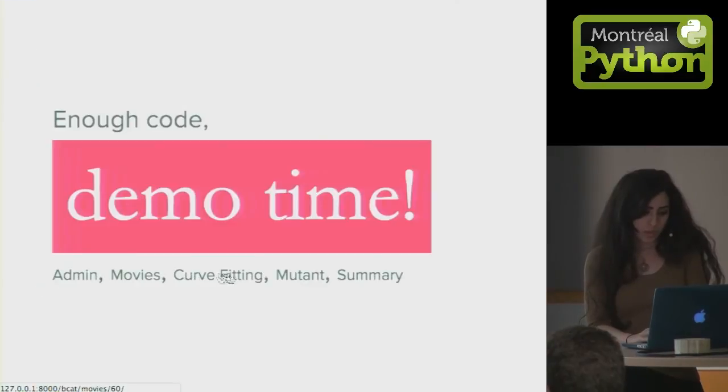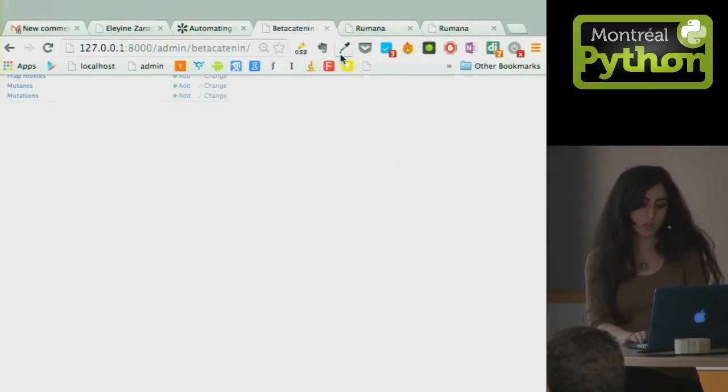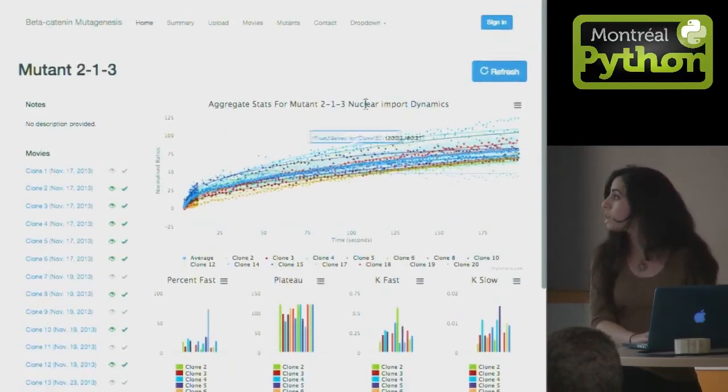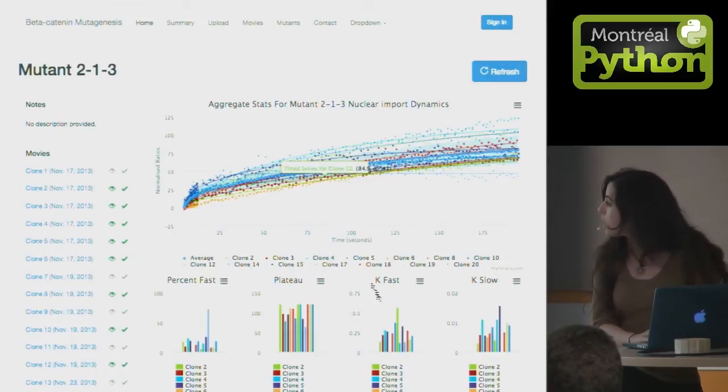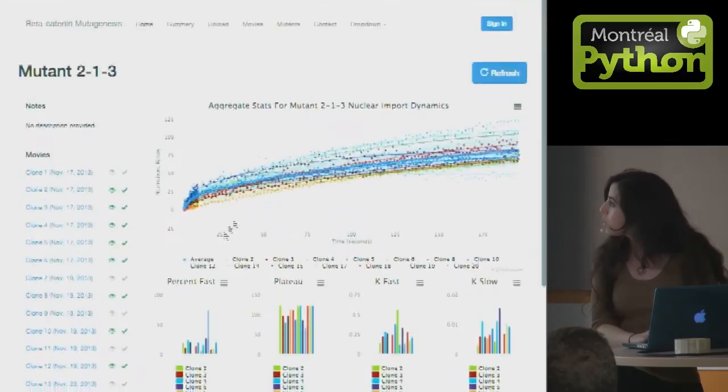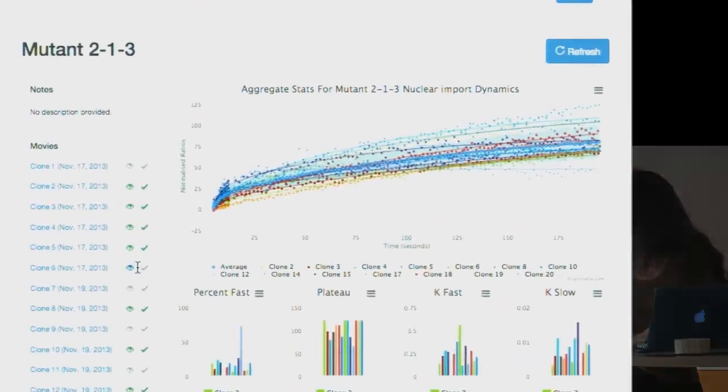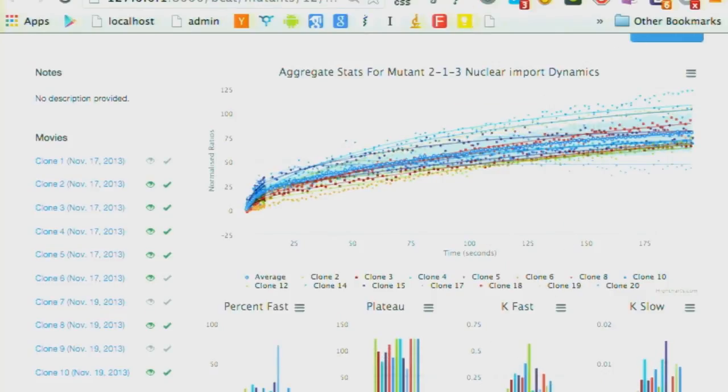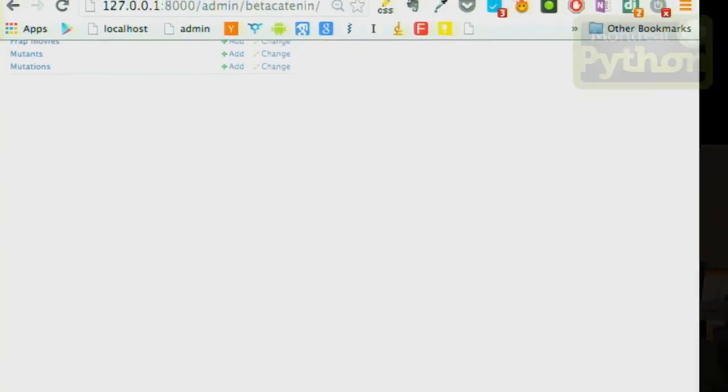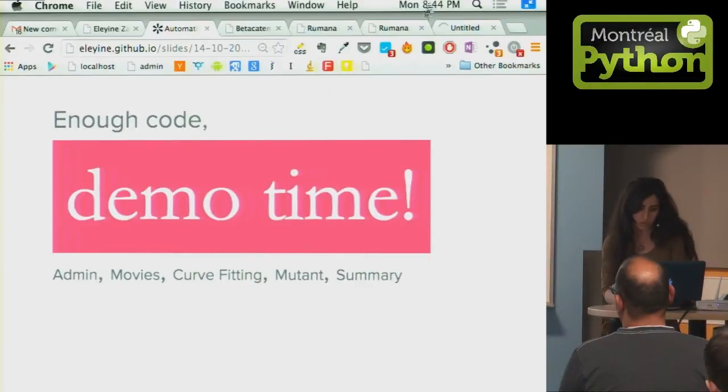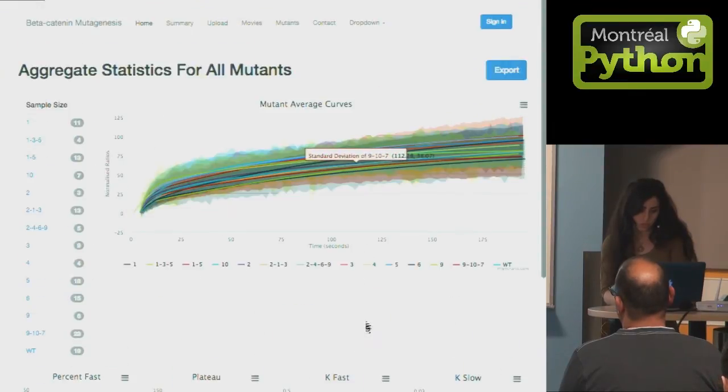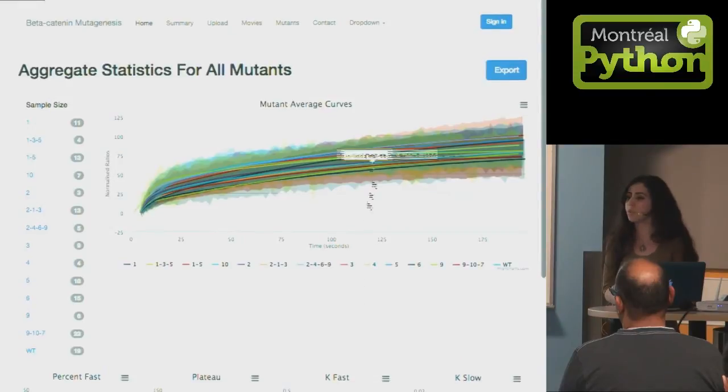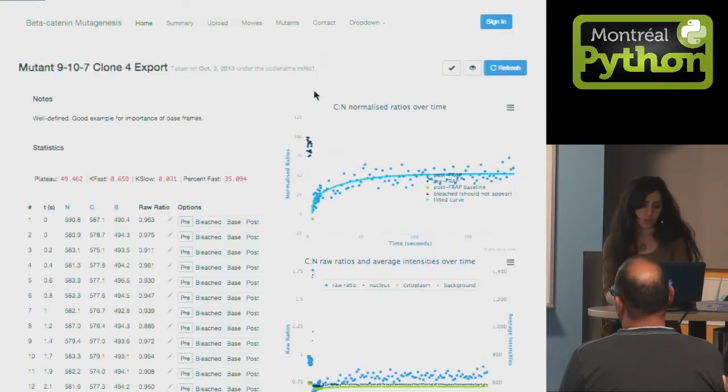One other cool thing is I can also analyze data in bulk. I can use all this data and aggregate it and have a nice visualization out of it. I can set things as invalid, like this one—I don't want it. So I refresh it. This is another example of a summary kind of graph.